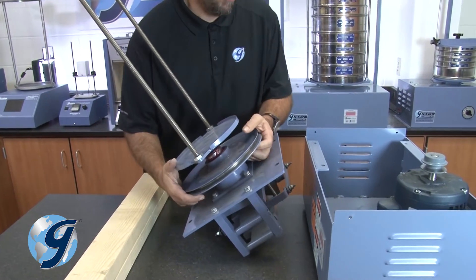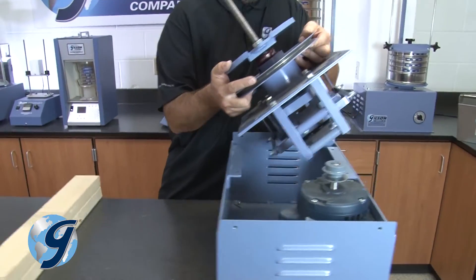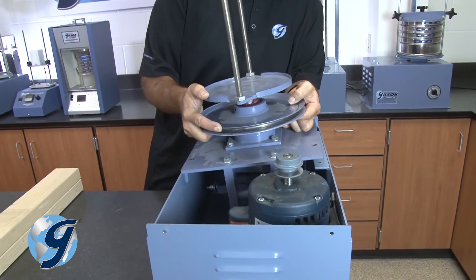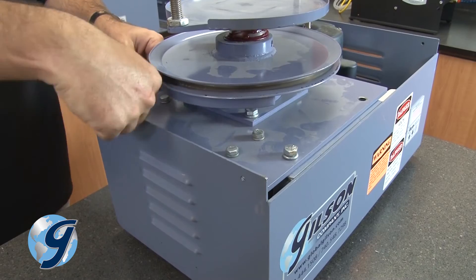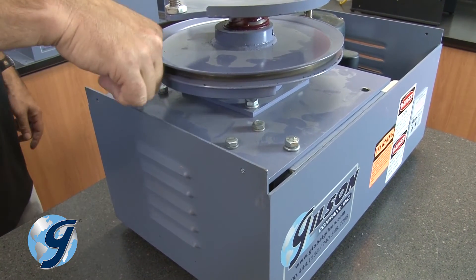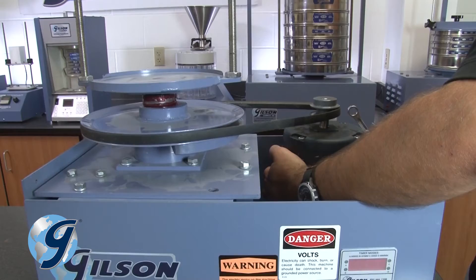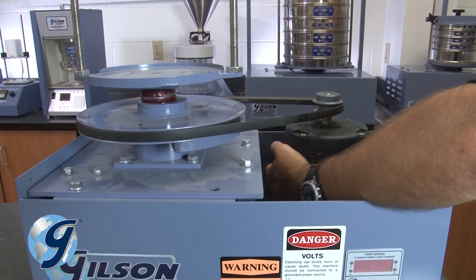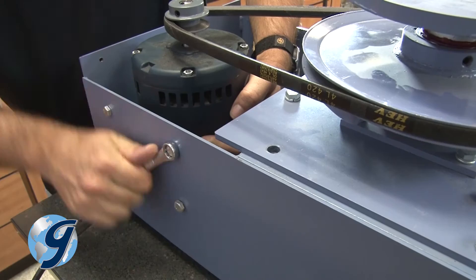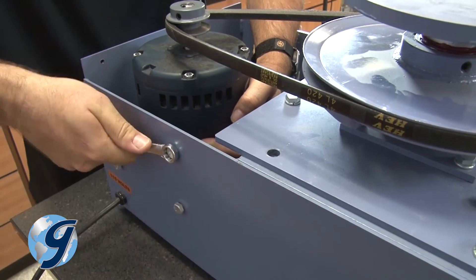Now that you have completed your internal inspection of the unit, return the entire assembly to within the case. Insert the two cap screws to the mounting plate and tighten securely. Next, return the drive belt onto both pulleys and pull the motor to the right to tension the drive belt, and tighten the four motor mounting bolts.